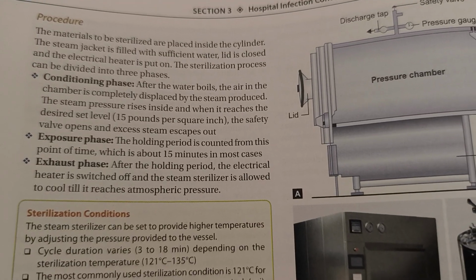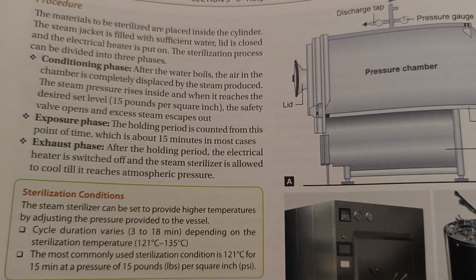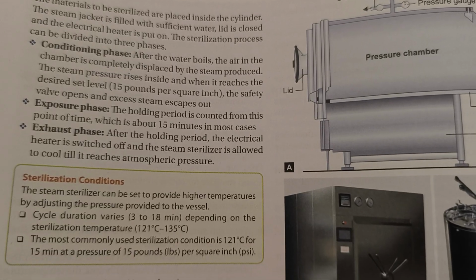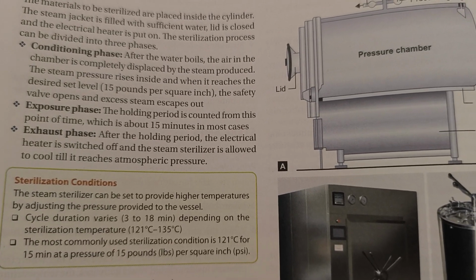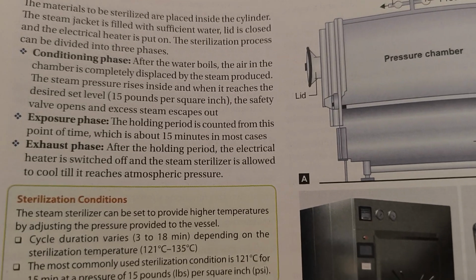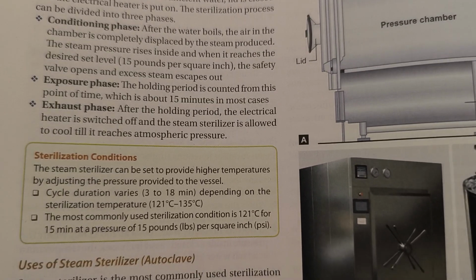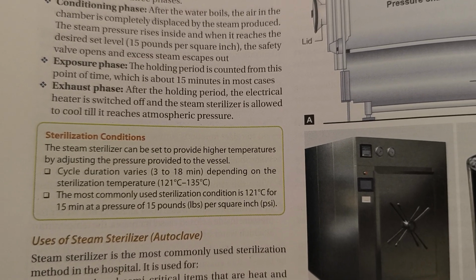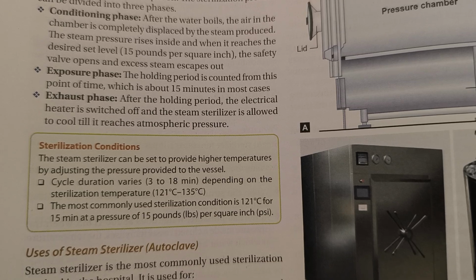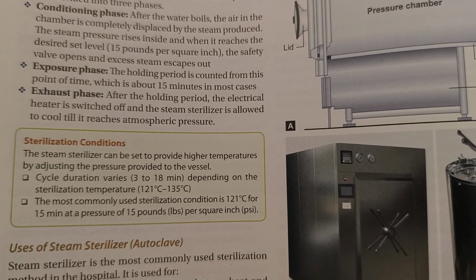Procedure. The materials to be sterilized are placed inside the cylinder. The steam jacket is filled with sufficient water. The lid is closed and the electrical heater is put on. The sterilization process can be divided into 3 phases. Conditioning phase. After the water boils, the air in the chamber is completely displaced by the steam produced.